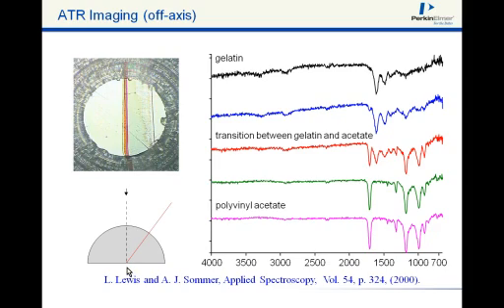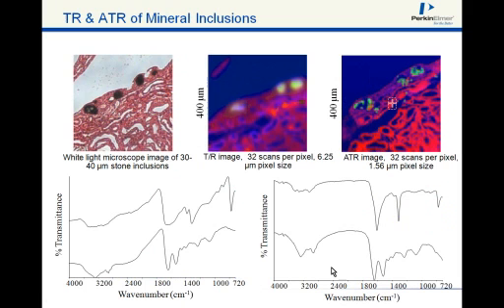Now the way this works is, if you picture down at the lower left where my cursor is, that's where the sample would be, and we would take a scan and get 16 spectra. Then we would move the stage a little bit and now take another scan, get another 16, and so forth. It may sound tedious, but at 170 scans a second, it doesn't take long. Here are some examples which could be of some use.